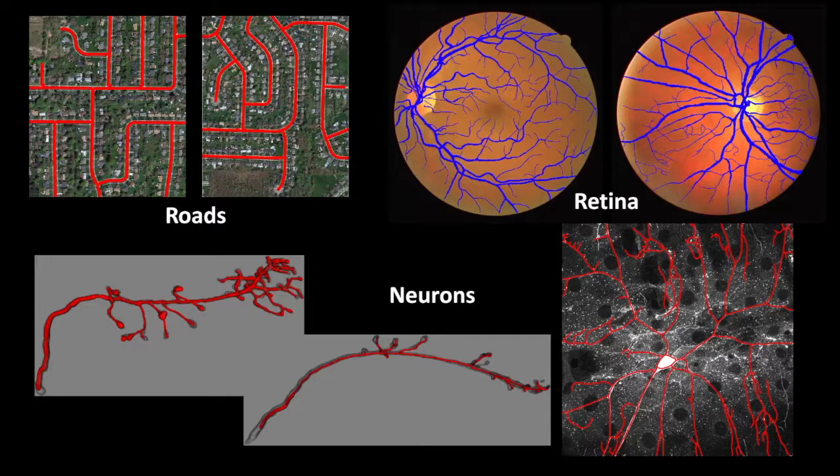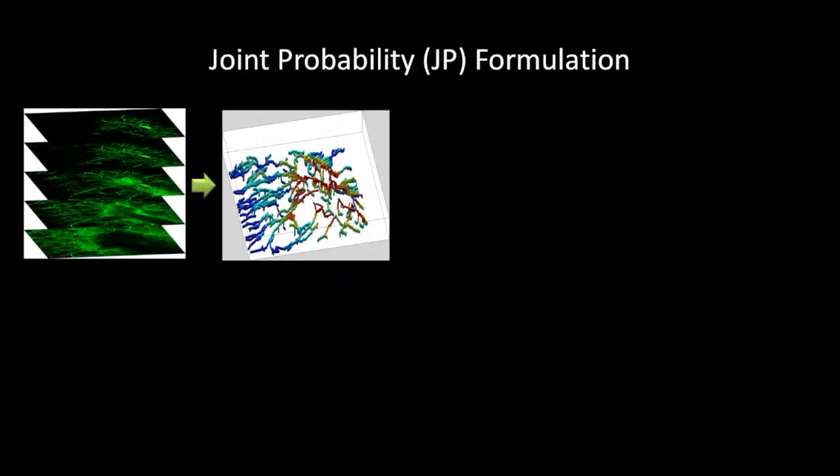Our focus is on neuron image stacks with insufficient contrast and spatially varying signal-to-noise ratio. We propose two methods for neuron tracing in a single image stack based on open snake population. Our main contribution is the cooperation among snakes to combine global shape with local features. The main difference between these methods is the problem formulation.